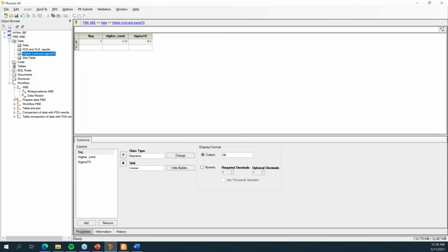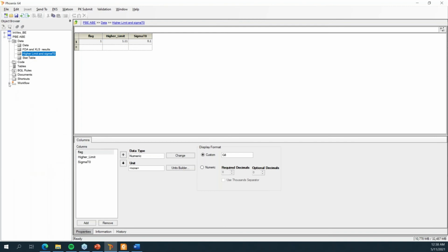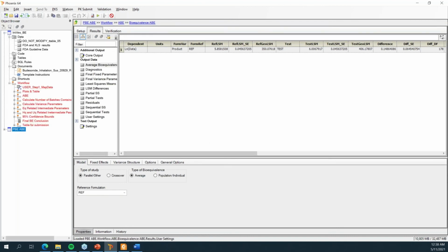So if you need to use these templates, I wouldn't recommend you meddle with these two tables. This is a detailed template that goes on, and I'll be concentrating more on the second template, because this first template, just as you mentioned, is just a guideline for you to go through the process of how the calculation is being done. The second template is what we started developing. When I say we, what we added extra is this guidelines documentation.